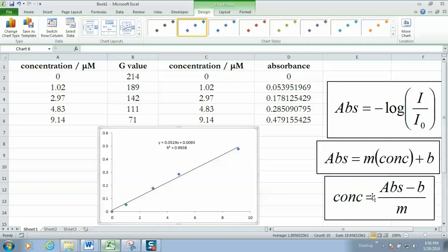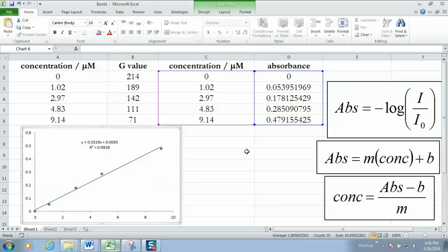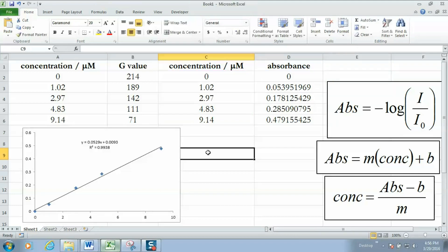You might recall that our absorbance, excuse me, our green intensity of our unknown was 116. So from that I need to calculate the absorbance. I'm going to go ahead and do that now. So I'm going to use this equation to calculate the absorbance of my unknown. In this cell I'm going to type equals negative log. The green value of the unknown was 116 and we'll divide that by the green value for the blank. So I see that 0.266 approximately is going to be the absorbance of the unknown.